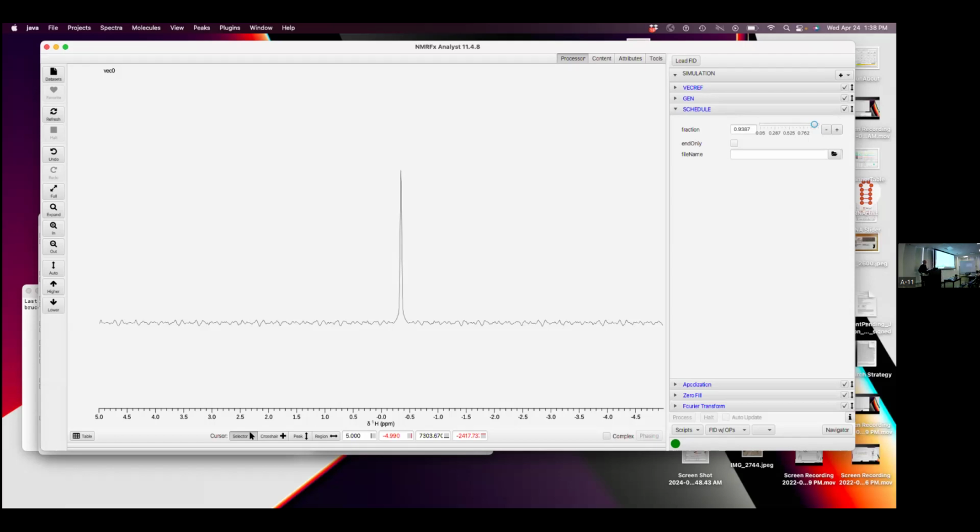There is something called the point spread function, which comes really from optics. You can think if you take a light beam and put it through a lens or an aperture and it spreads out after it goes through, how it spreads out is the point spread function. And so the stuff that is out here, the spread out, is actually light, but it should have been at the center. So when we don't properly treat it, we're doing two things. We're increasing these streaks and noise in the spectrum, and we're actually reducing the intensity of the signal. So adequate NUS processing doesn't just get rid of the streaks and noise, it actually puts the signal back.